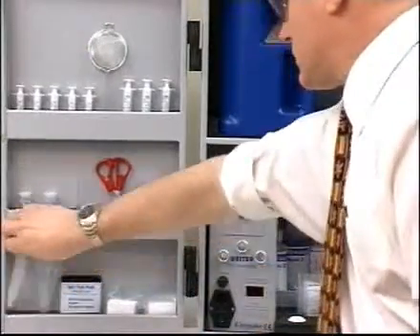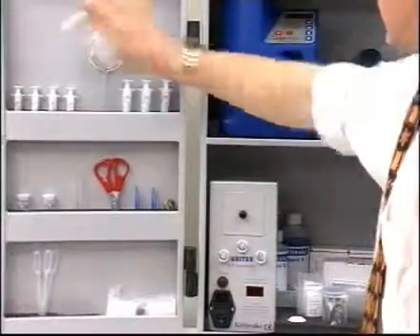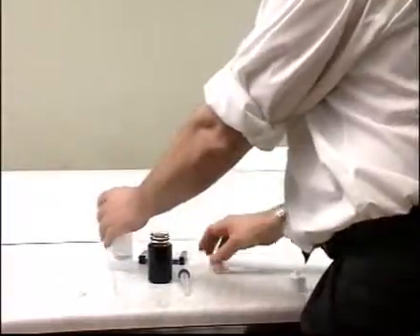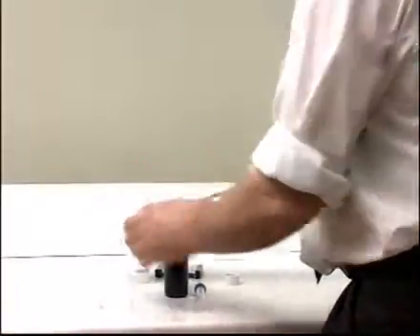This section shows you how to test for salt water contamination. First, place two milliliters of reagent H in a test tube.